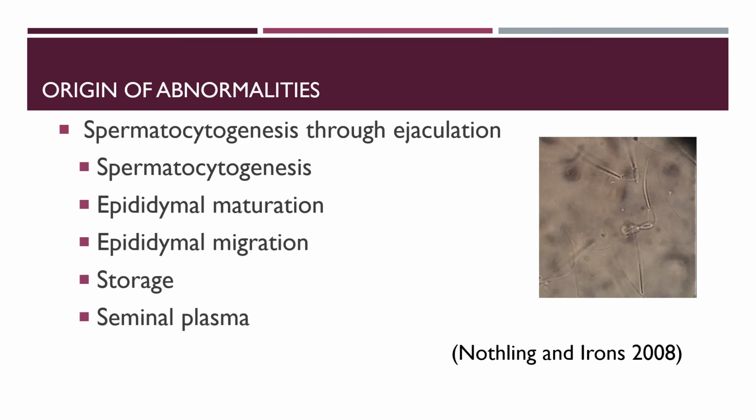And this picture is of a sperm cell with a pinched head. I don't think this is any specific defect. I took this picture myself, but I just thought that was a good representation of an abnormality. I'm not sure if this cell has a tail. It looks like it might have one tucked underneath of it, but I'm not sure. But this would be an abnormality that wouldn't be very common and would still fall under that blanket term of abnormal contour.